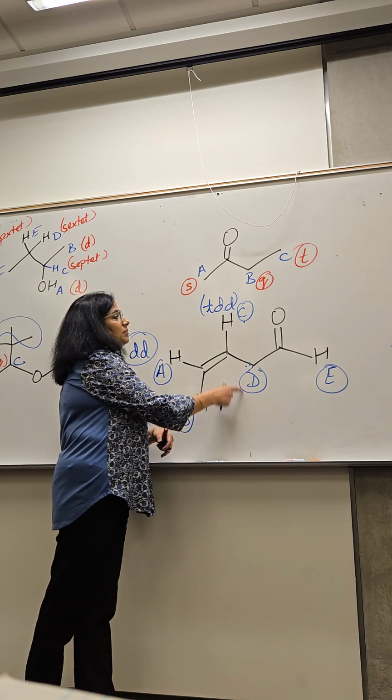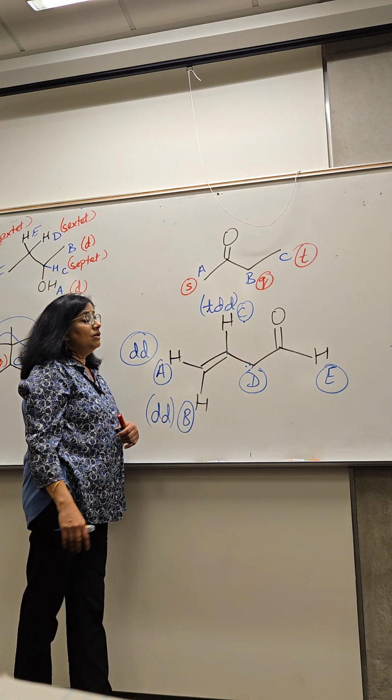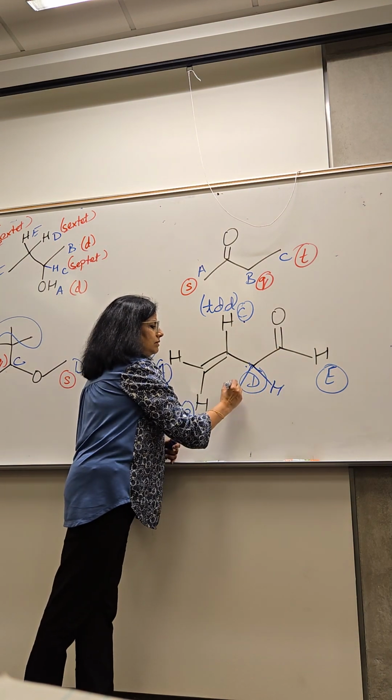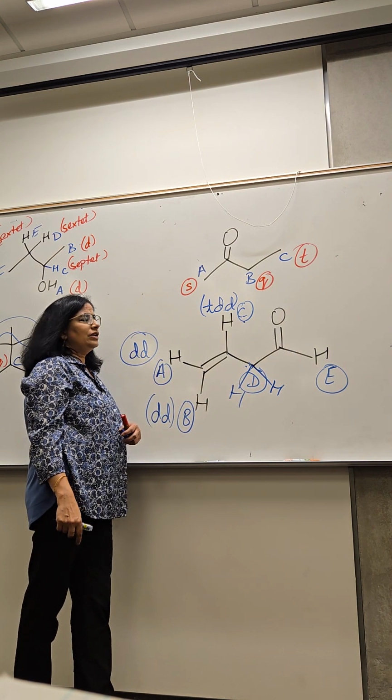Wait. Is D coupling with C? Yeah. Is D coupling with E? No, too far away. Is it? 1, 2, no, it's not. Here's the H. 1, 2, 3 sigma bonds. Yeah. So let's try that again.